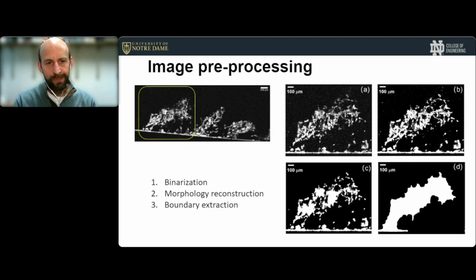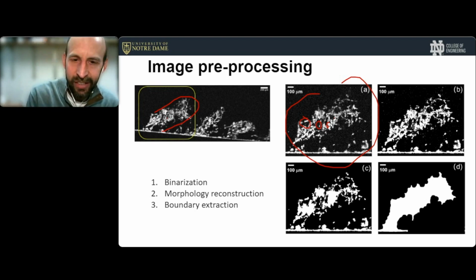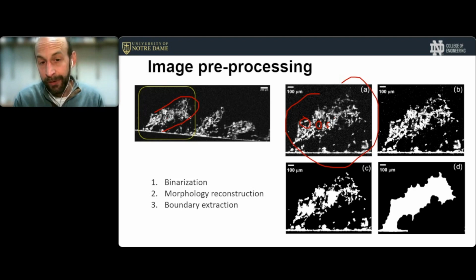So our idea was, okay, let's take a biofilm, like this biofilm here, and use the OCT signal, and you can see it's quite heterogeneous. Let's look at this image here. There are areas with strong signal, and there are areas with very little signal, probably because those are voids. So if we can use this to map the mechanical properties, assuming that the cell density, which we're inferring with the OCT, corresponds with a mechanical property. So we didn't measure the mechanical properties directly, but we inferred them from the OCT signal, that we can get a better prediction of the mechanical behavior.